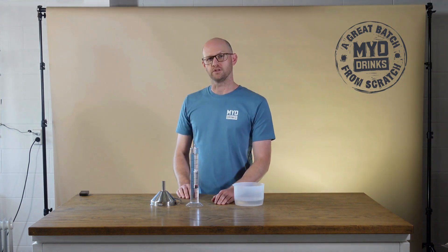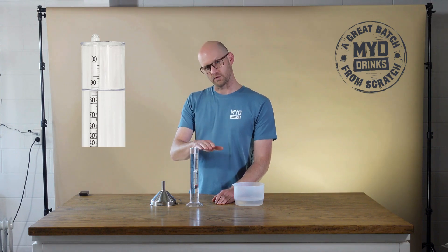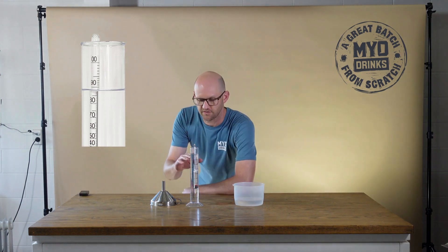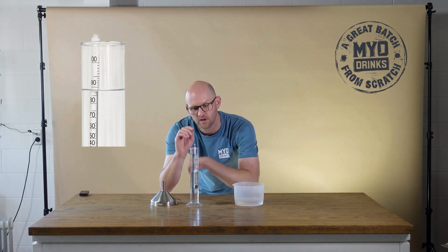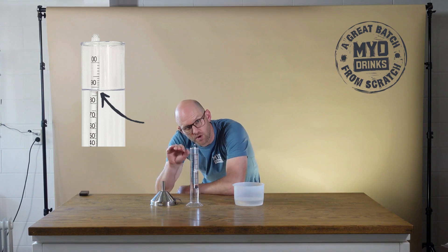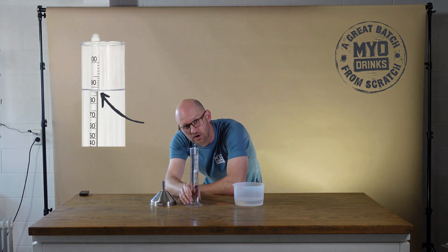An important thing to note when you read an alcometer is that you want to take your reading from the bottom of the meniscus. The meniscus is the surface tension of the liquid as it forms up the side of the alcometer, so you want to take your reading at the lowest point of that liquid when you look through your trial jar at your alcometer.